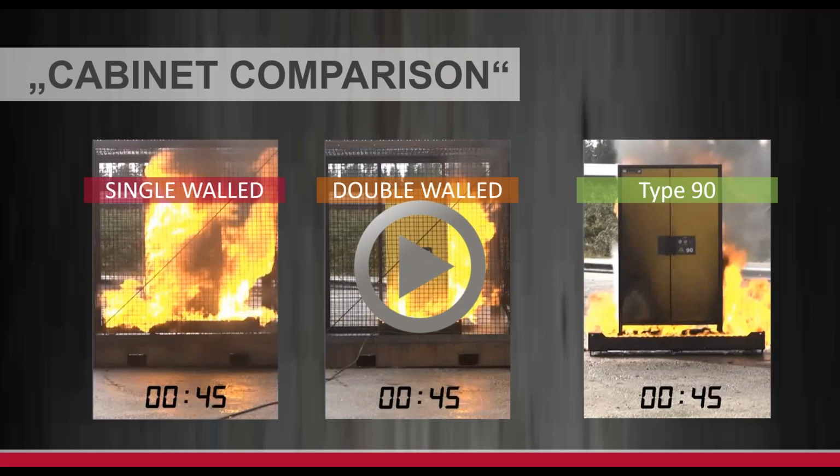It's really passive fire resistance versus active. So the 2 on the left, whatever happens to them along the way happens to them. The one on the right, there are things that happen inside the European design of cabinets, or these 90-minute cabinets, that increase the amount of fire resistance they can have.